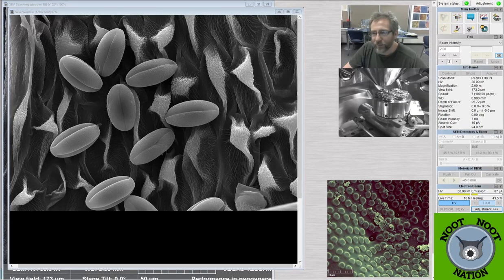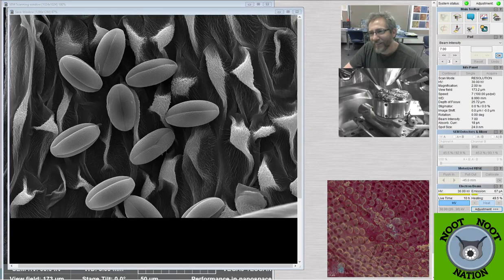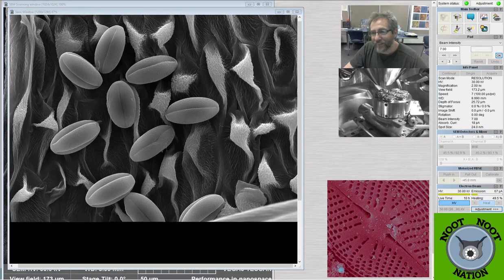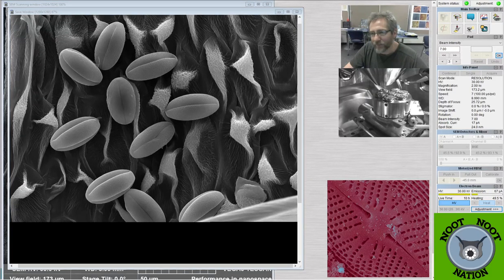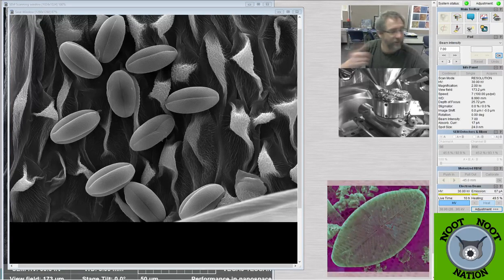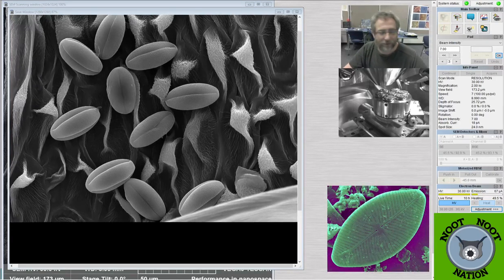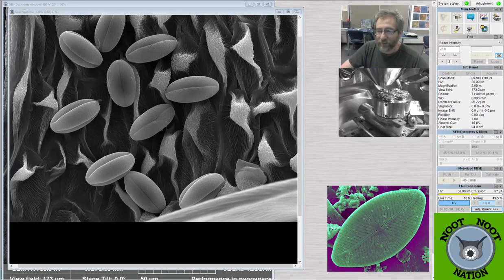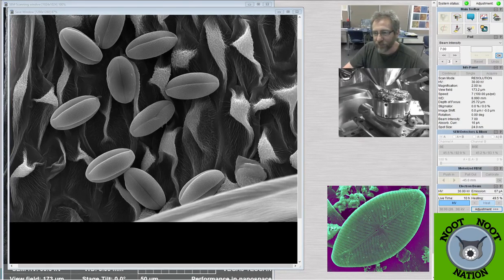Let's see. Yeah, good. Sneezy. It doesn't take long. It's a couple of minutes at most. So let's see. And then we did sputter coat last time I was on. So if you want to see into the SEM or see the actual sputter coating process, I did that in my last stream. So you can head back and catch it.